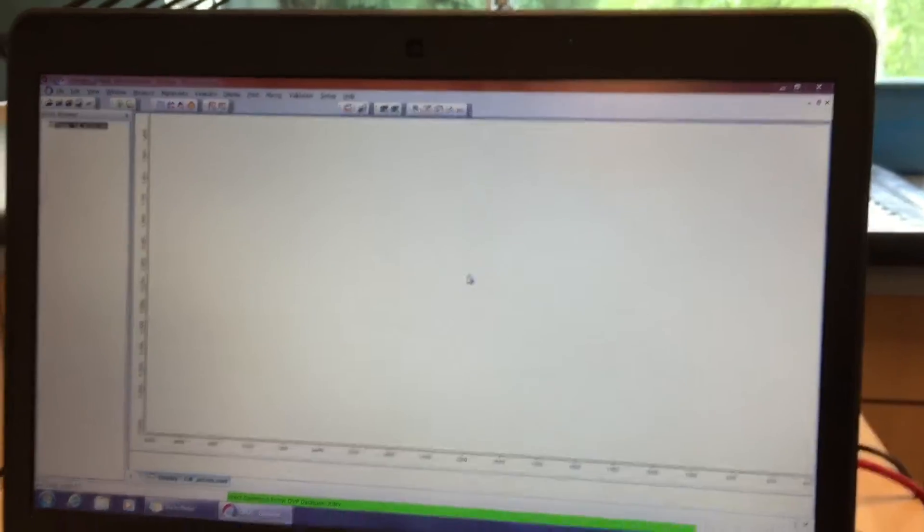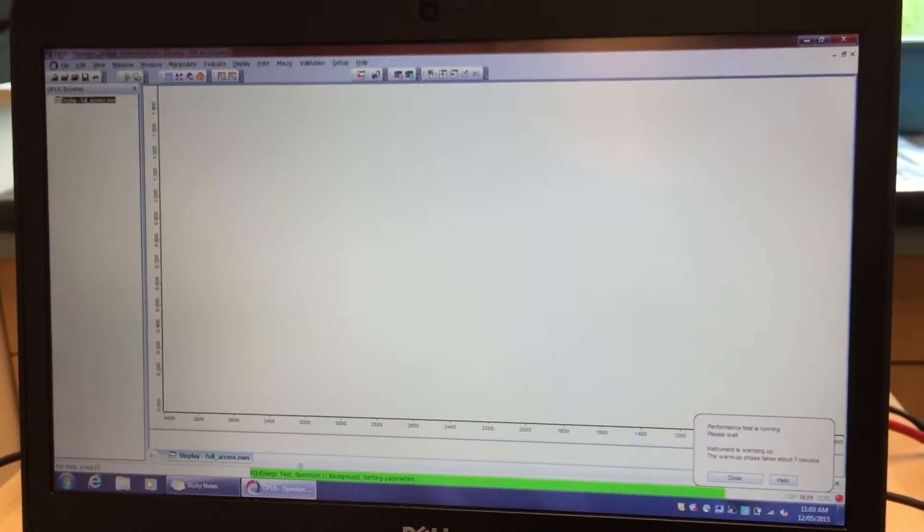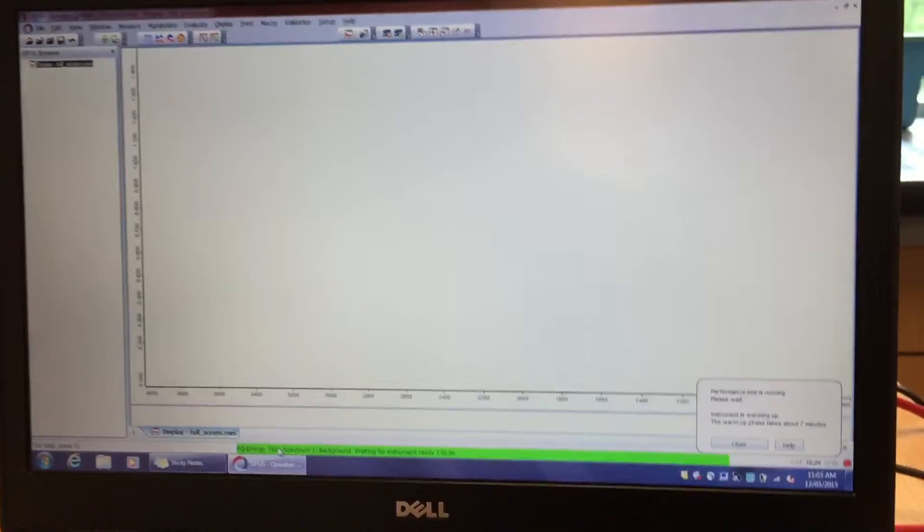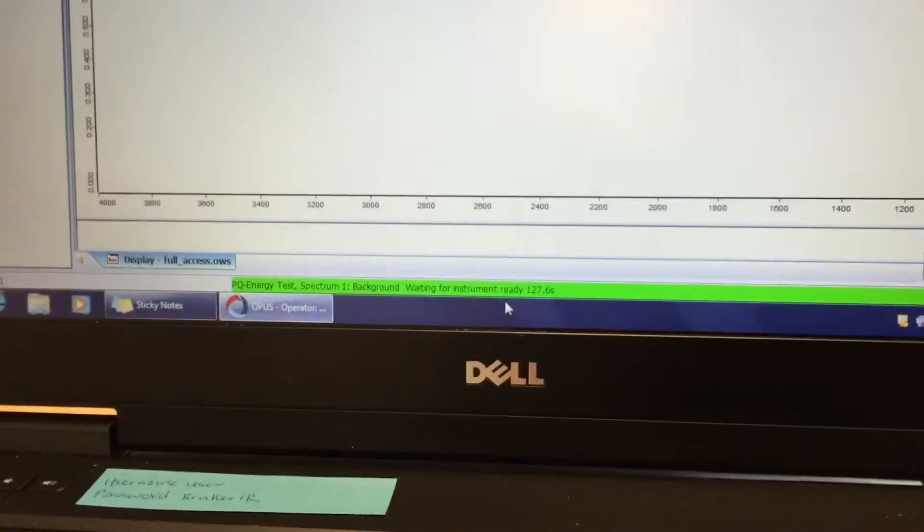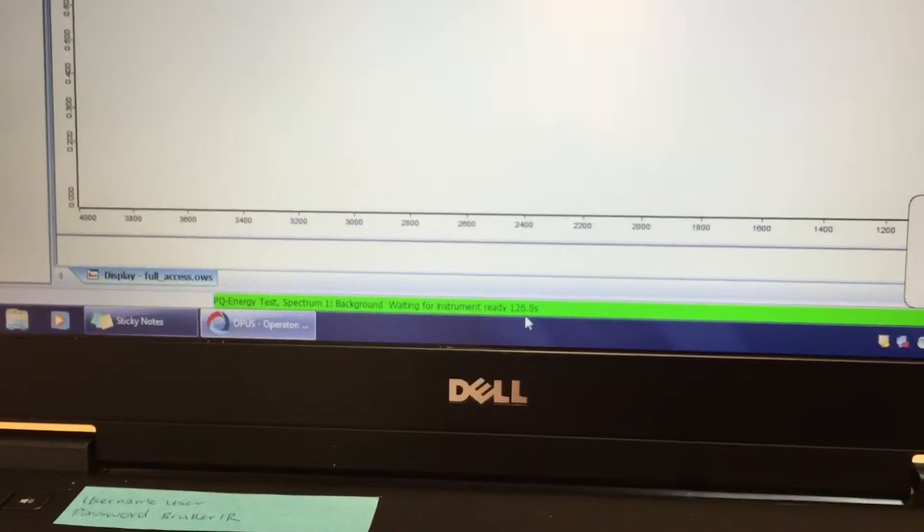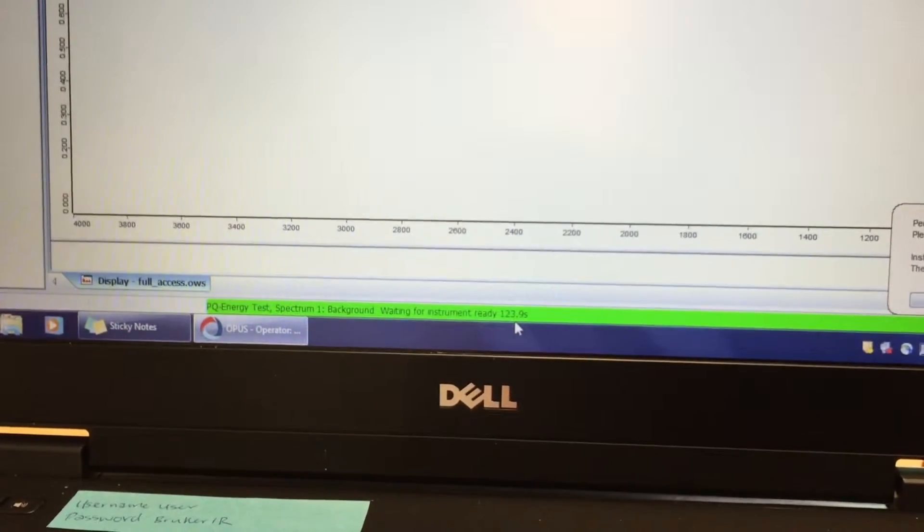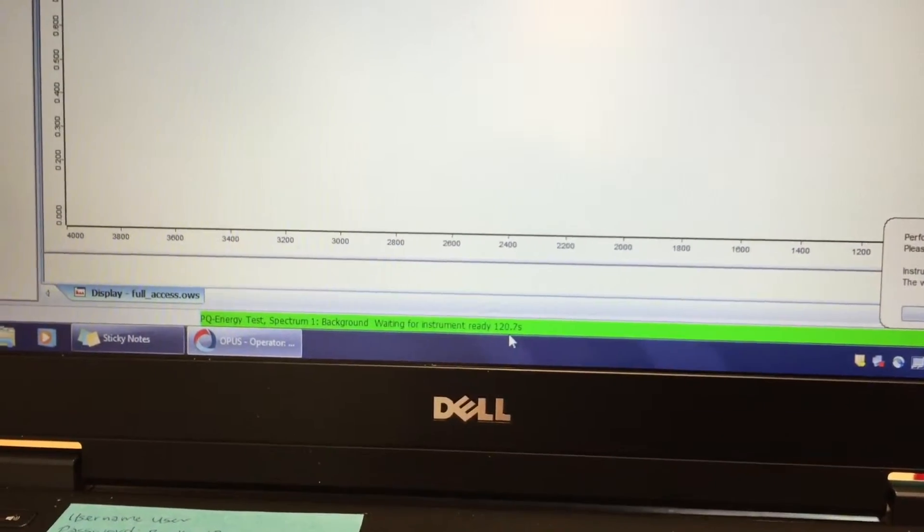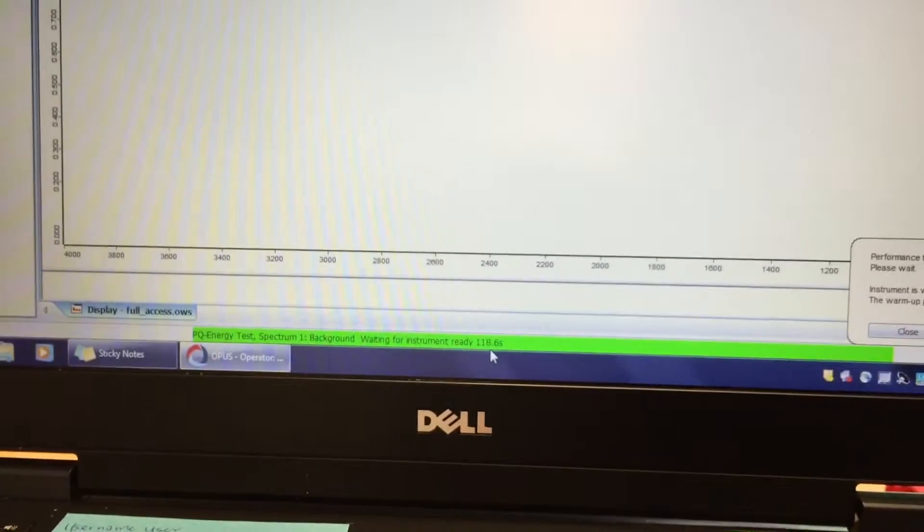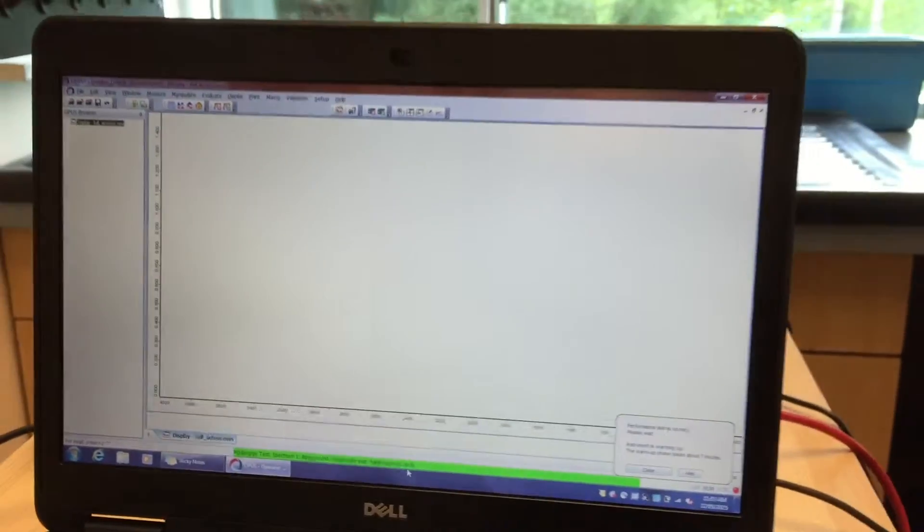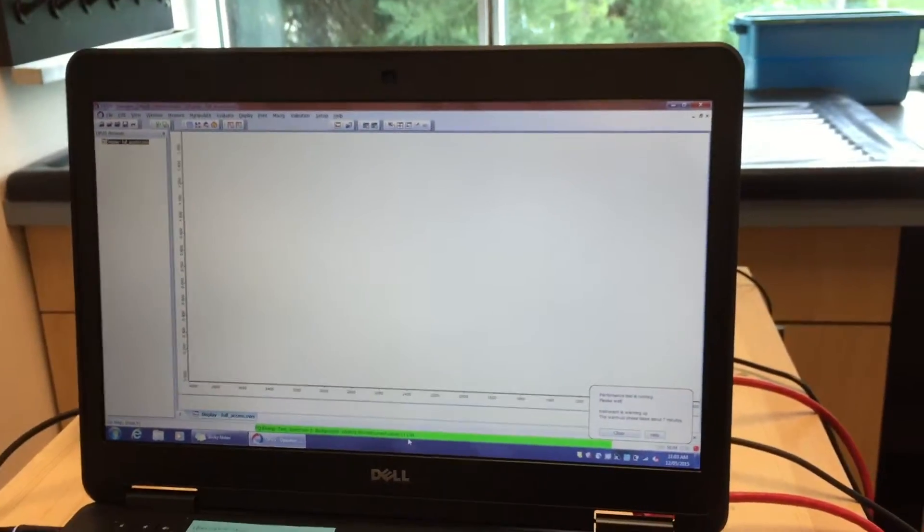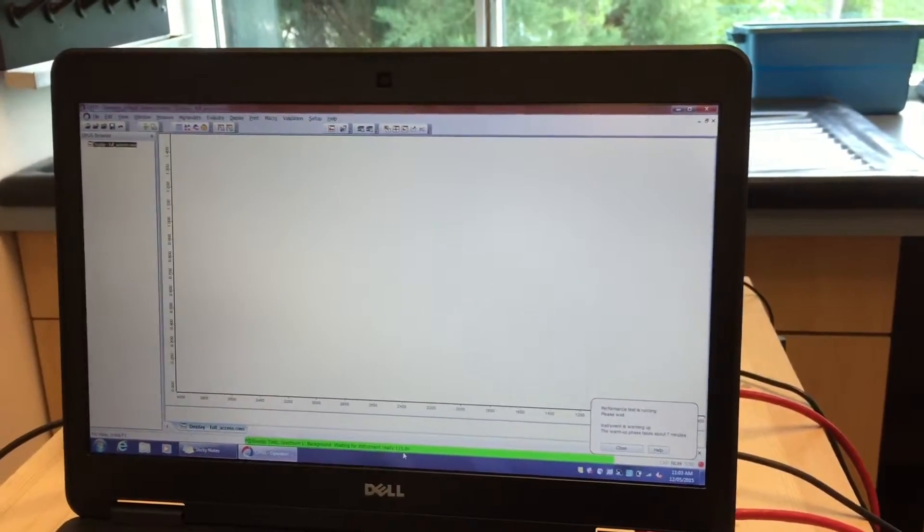Okay, so now notice down here there's a green bar telling you that an energy test is being run. It's going to take 126 seconds to complete. This should automatically pop up when Opus is opened and connected to the instrument. This means the computer and the instrument are connected and they're running their test to see if it's going to work properly.